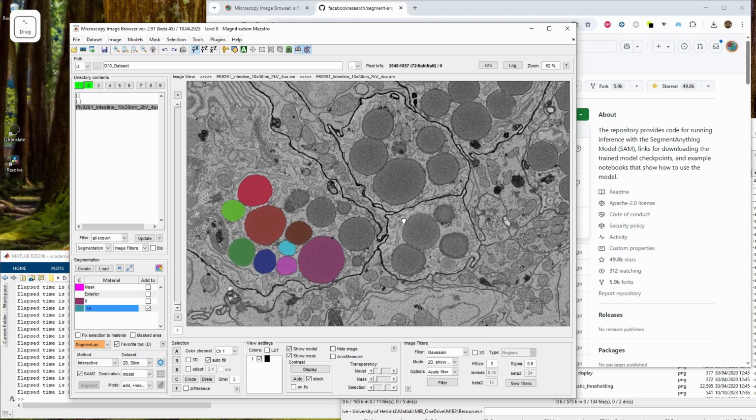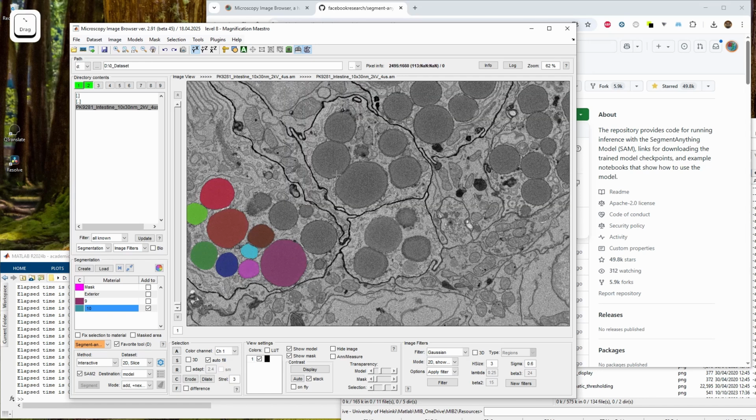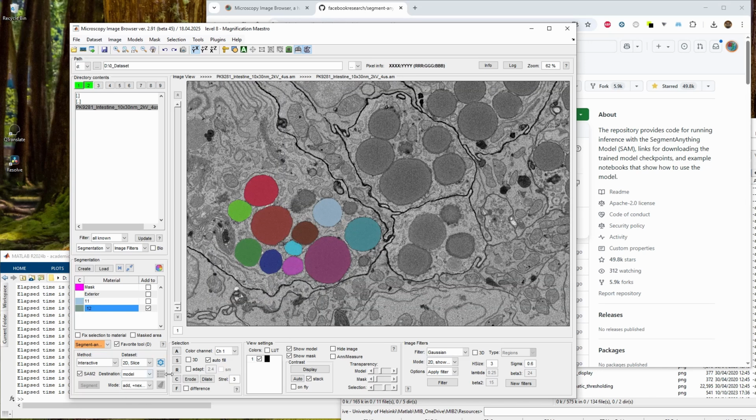It's also compatible with the Shift and Control clicks. For example, let's say I want to take like these three together. I click on this, I hold Shift, Control, and then it will combine this all together. And also I can still press Ctrl Z to undo selection of the whole area. So in this case, I can basically continue this. So this add plus next is very suitable for the situations when we need to create individual instances. Then it works pretty much kind of automatically.